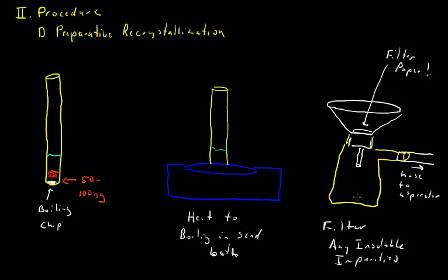That is, the filtrate down here is all liquid. That means that it, of course, isn't saturated. And so you're going to have to boil some of this off over here gently, again with a boiling chip. So that's something you may have to do, boil some of it down, maybe boil about half of it off, and then allow it to cool. And if you still don't get crystals, you have to boil more off. But at some point, you'll get to the point where it's saturated.